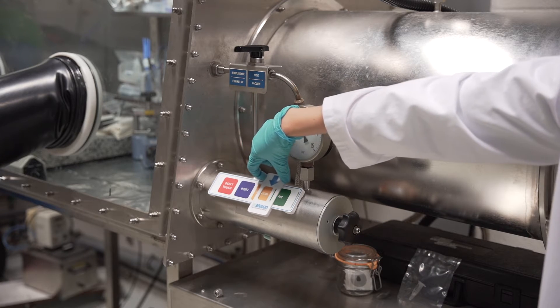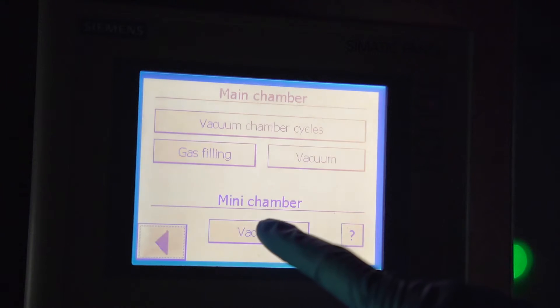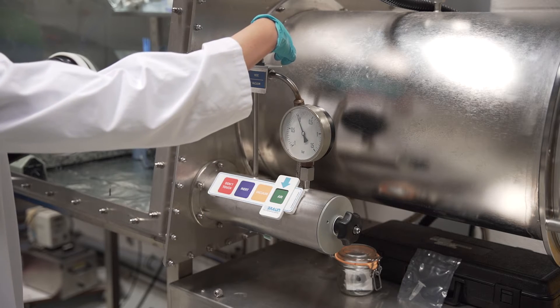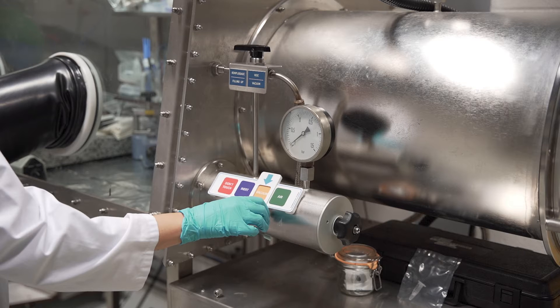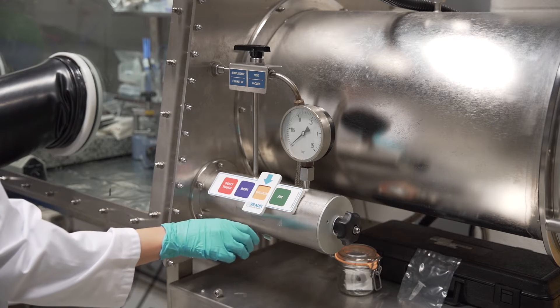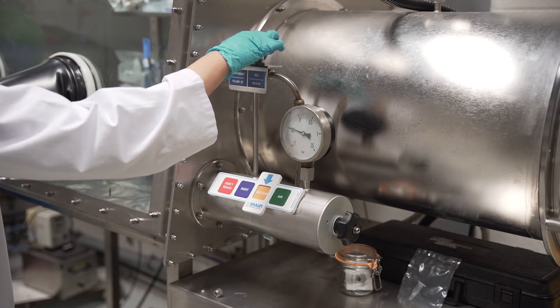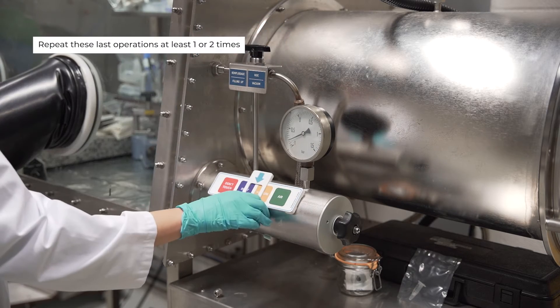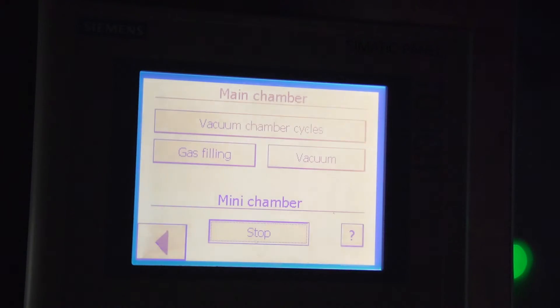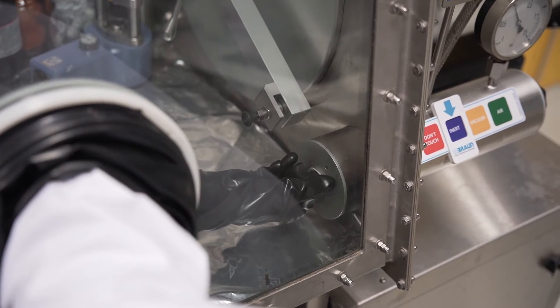To create a vacuum in the small chamber, on the panel screen press the manipulations section, then vacuum chambers, then mini chamber vacuum. Turn the three-way valve one quarter turn to the right and remain in this position for 2 to 5 minutes, until the gauge needle equals minus 1. Return the three-way valve to its position perpendicular to the chamber. To fill, turn the three-way valve one quarter turn to the left. Return the valve to the perpendicular position. Repeat these last operations at least one or two times. Stop the pump by pressing stop on the screen in the mini chamber section. Open the inner door of the small chamber to introduce the material into the glove box and then close it immediately.